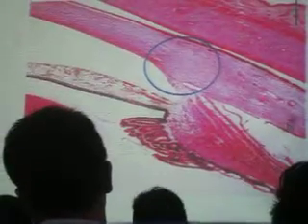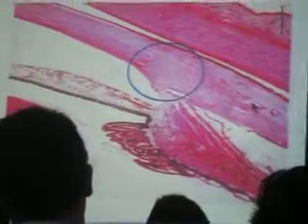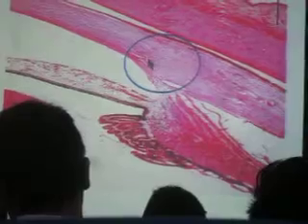So posteriorly, okay, you have the sclera, and it is opaque, as I said, compared with the more transparent cornea. And the junction between the 2 is what you call your limbus. Okay? So you have the transition from your opaque part of your sclera.